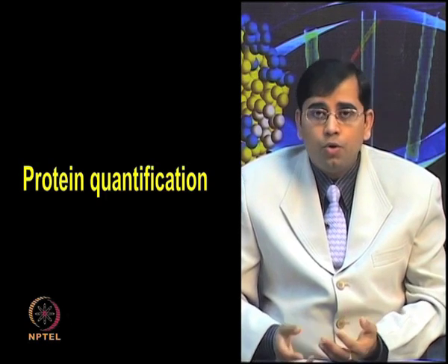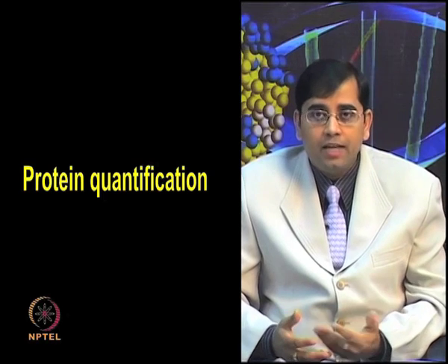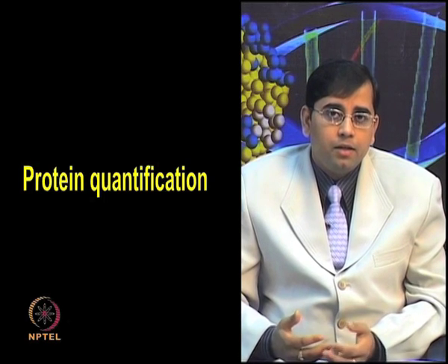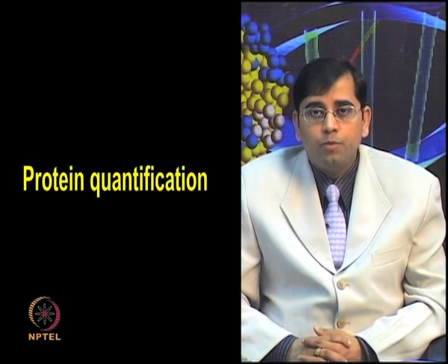Now, you want to know how much protein quantity you have in your sample, whether you can perform your experiment with that protein or not. So, one needs to know the protein quantity present in the protein sample. There are different types of protein quantification methods available. We will talk about protein quantification in detail now.